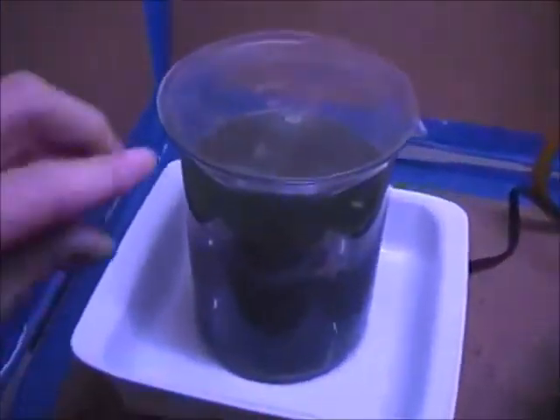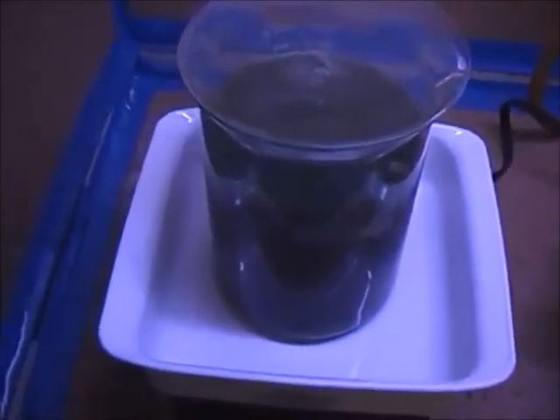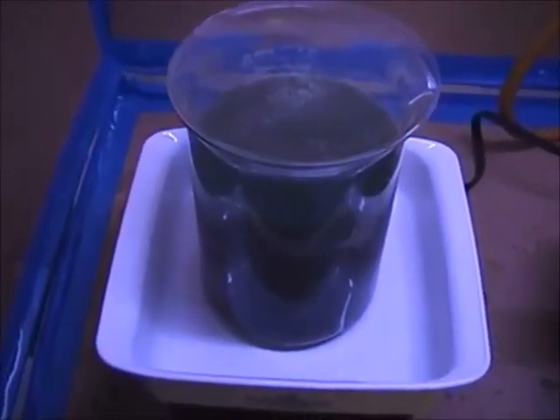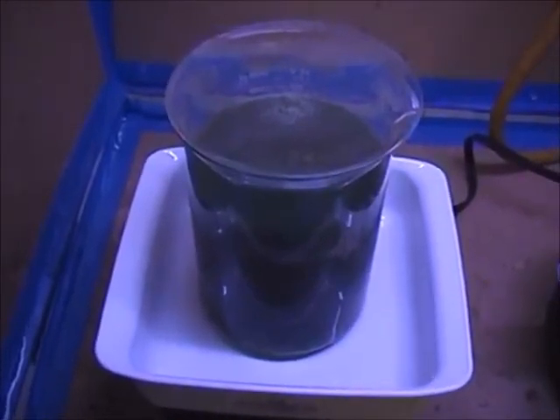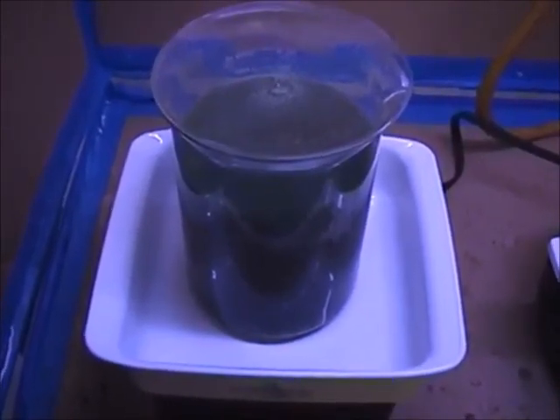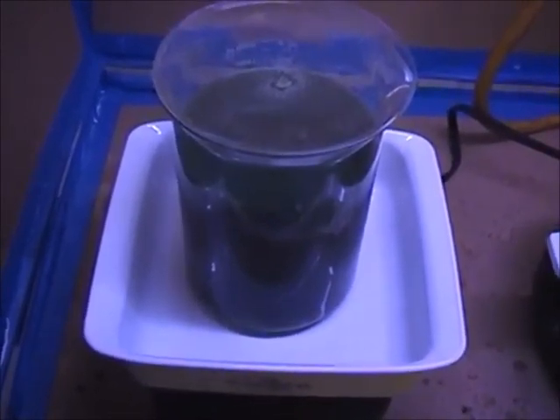So what I'm going to do now is cut away for just a moment. Our other solution is still over here precipitating out and bubbling nicely, and we have spongy silver in the bottom that looks like barnacles, which is usually pretty easy to filter and wash. I'm going to cut away for a minute, and we're probably going to let this reaction run for the rest of the night. I'll let it settle out, and then I'll come out here in the morning and start filtering and recovering this silver, and we'll wash it and see what kind of product we've produced so far. So I'll probably see you gentlemen in the AM sometime.